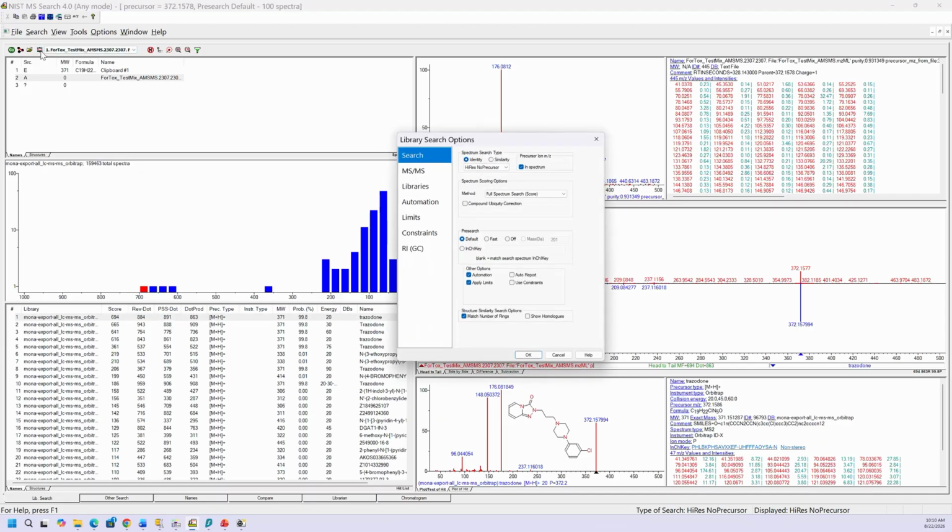Let's check another type search. This is a way that I use sometimes if you want to mix and match high resolution with low resolution spectra, libraries, etc. It says EI normal, but it really just searches nominal mass and it lets you use all of your libraries. So I find that useful at times. And it's really just a pattern match, but it doesn't restrict you to using only high resolution libraries or high resolution imported spectra.